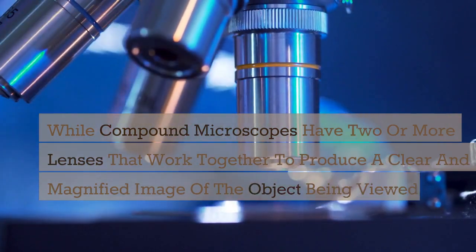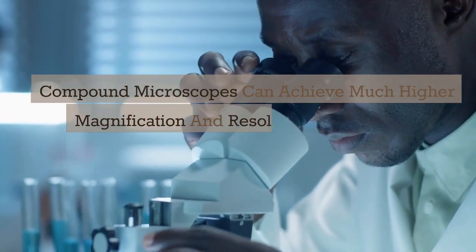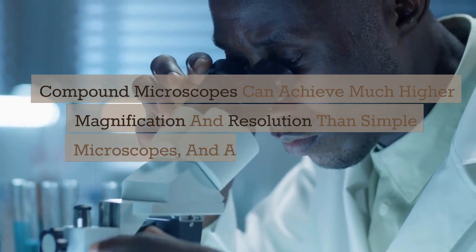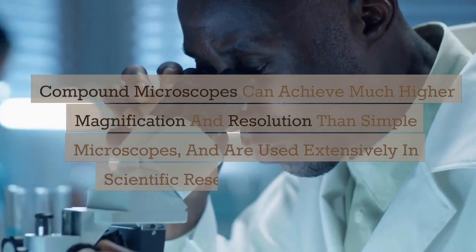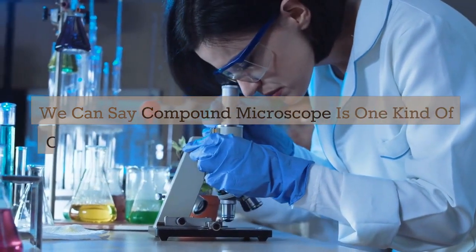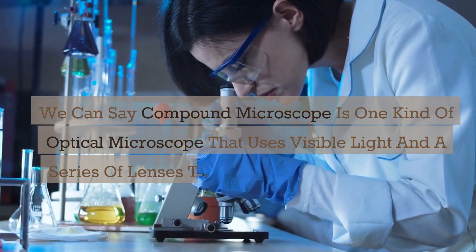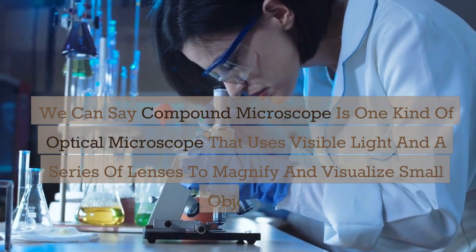Compound microscopes can achieve much higher magnification and resolution than simple microscopes, and are used extensively in scientific research and education. We can say compound microscope is one kind of optical microscope that uses visible light and a series of lenses to magnify and visualize small objects.